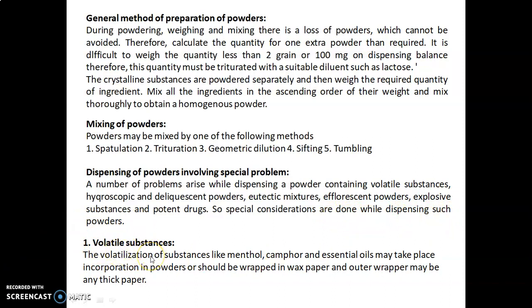Volatile substances. The first problem is for the volatile substances. The volatilization of substances like menthol, camphor and the essential oils may take place.